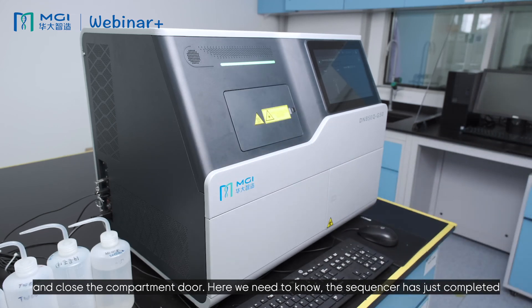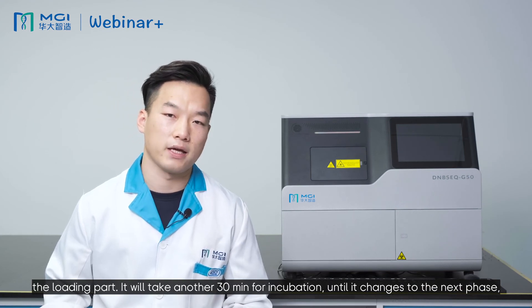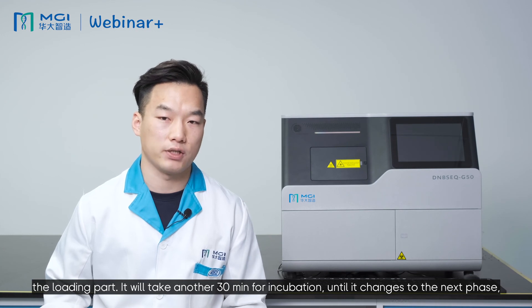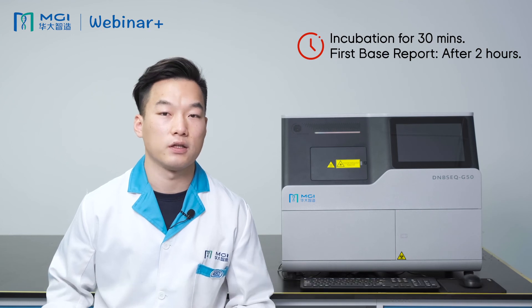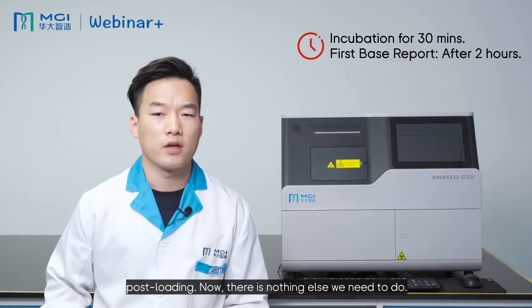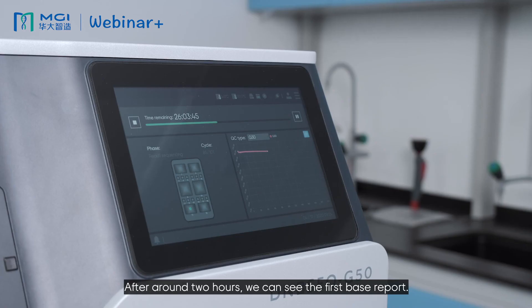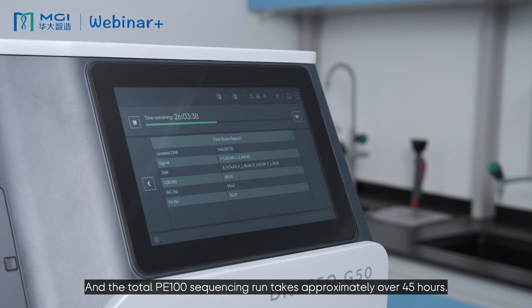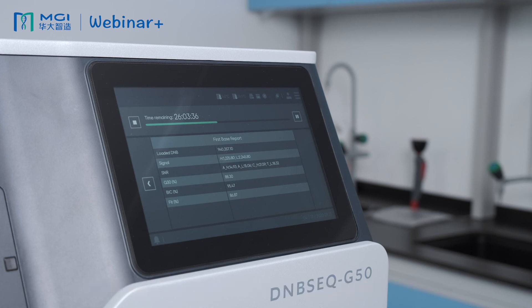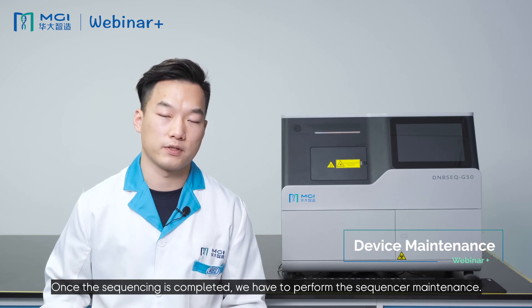The sequencer has just completed the loading part. It will take another 30 minutes for incubation until it changes to the next phase: post-loading. There is nothing else we need to do at this point. After around 2 hours, we can see the first base report, and the total PE100 sequencing run takes approximately over 45 hours. Once the sequencing is completed, we have to perform sequencer maintenance.